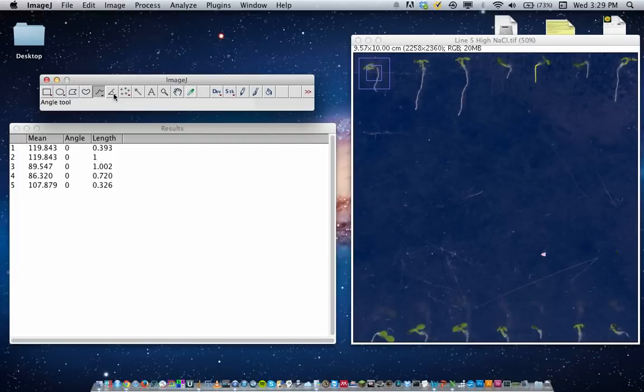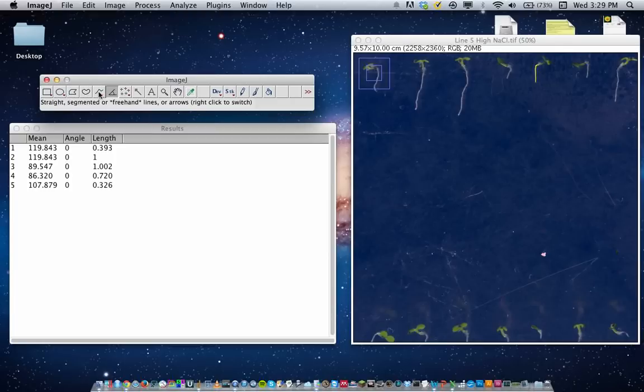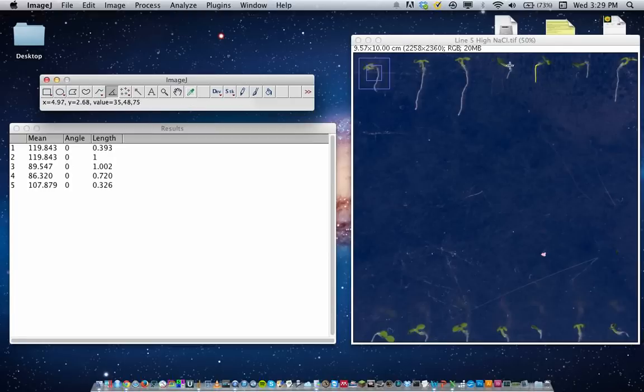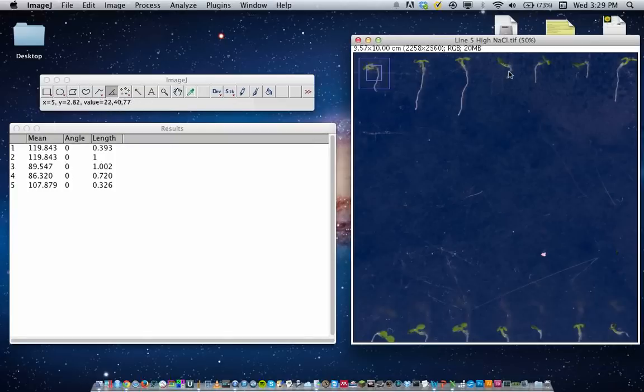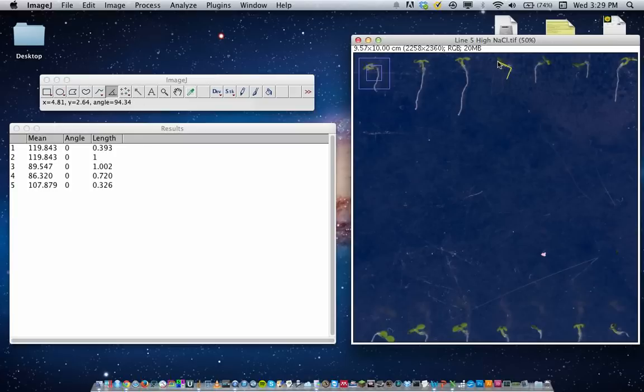So if I wanted to test the angle of this root and shoot angle, click first at one end of the thing, click again where you want the point of the angle to be, and then click one third time, and you should have some kind of angle here.